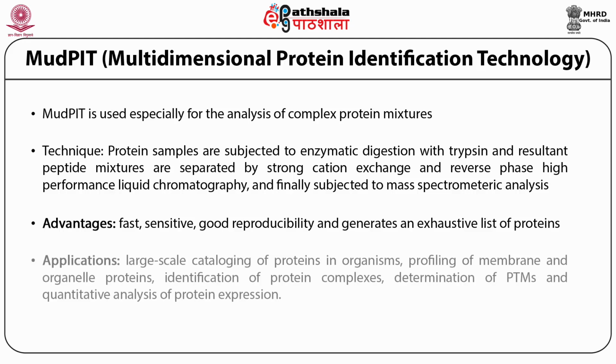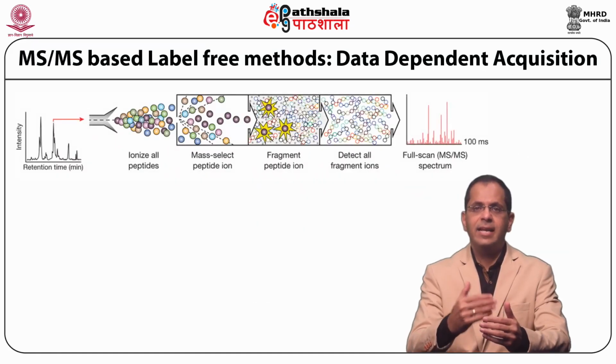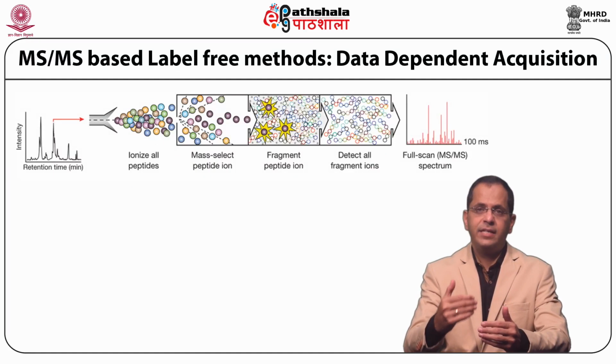These could be applied for large-scale cataloging of proteins in organisms, profiling of membrane and organelle proteins, identification of protein complexes, determination of post-translational modifications, and quantitative analysis of protein expression. MSMS based label-free, gel-free methods.